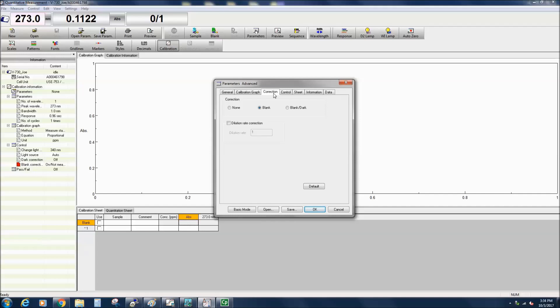The dilution rate correction corrects the measured photometric value of a diluted sample to give the equivalent photometric value for an undiluted sample.